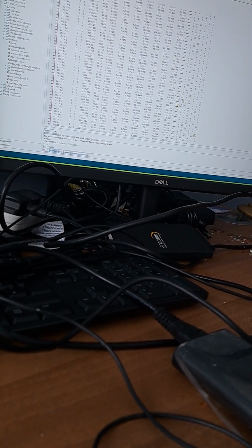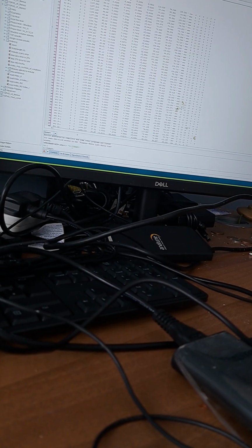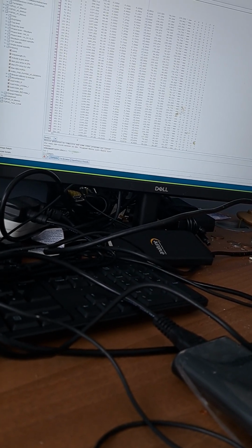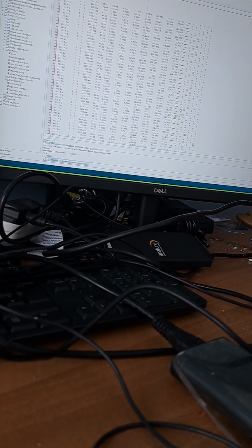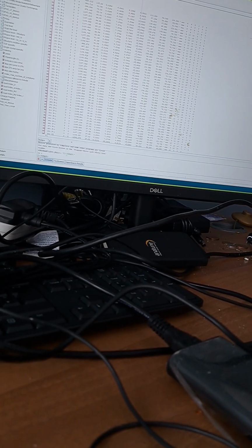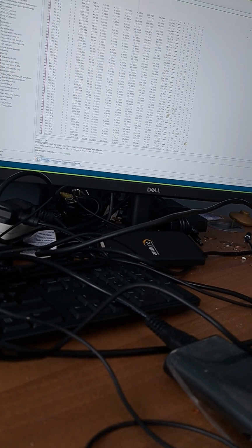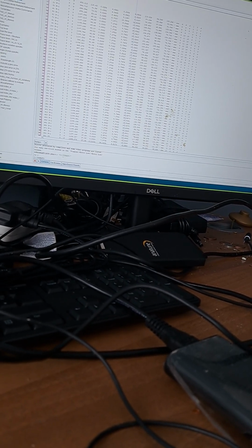What is the purpose of this, Sadia? I understand that you want to learn how to do indexing, but we've got a potential indexing already that looked pretty good. And I'm wondering, are we not looking to try and solve the structure? Yes, I was trying to follow what you showed me, and make my own file, and then I can go.